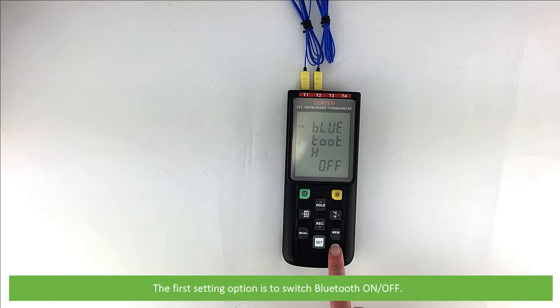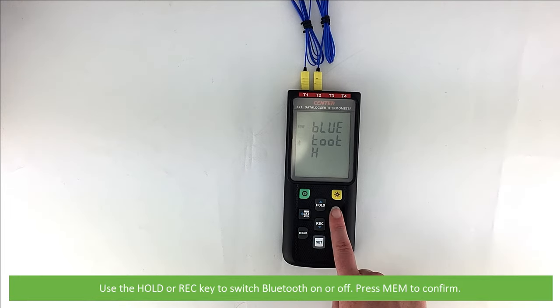The first setting option is to switch Bluetooth on or off. Use the hold or record key to switch Bluetooth on or off, then press mem to confirm.